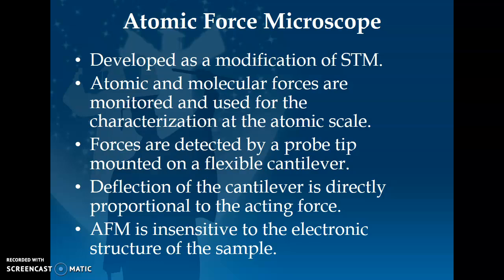Atomic and molecular forces are monitored and used for characterization at the atomic scale. Forces are detected by a probe tip mounted on a flexible cantilever.